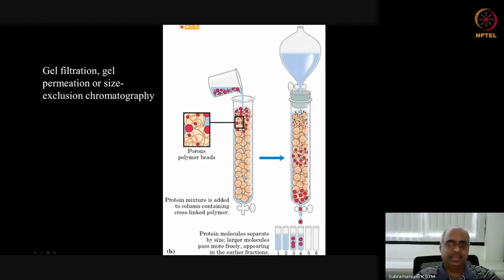Here we have gravity as the main source for separation. You have protein molecules that are globular in shape. Here shape matters. If you have non-globular proteins, this method is not the choice; for that we resort to other methods. This method is primarily for globular proteins, and most of the proteins that we work with are globular, except structural proteins like collagen, keratin or fibrin, which are long fiber-like structures. Otherwise, most cellular proteins, particularly enzymes, are globular in nature, so this method is widely used for separating them.